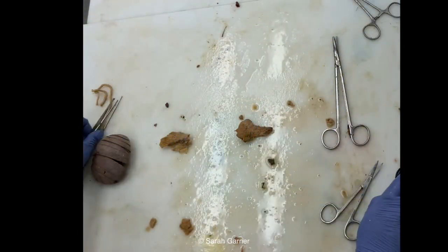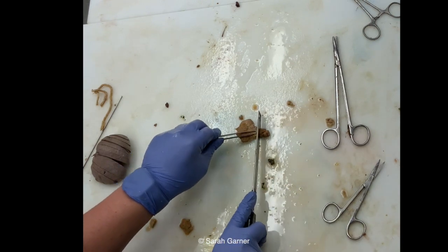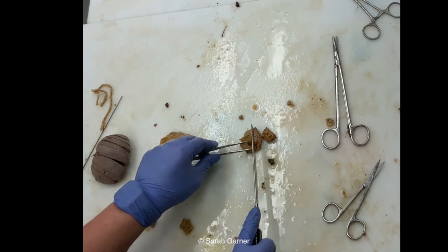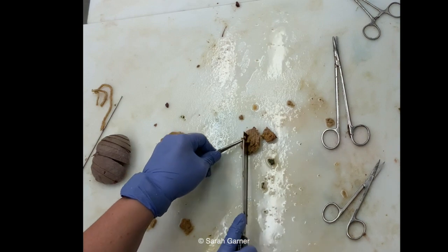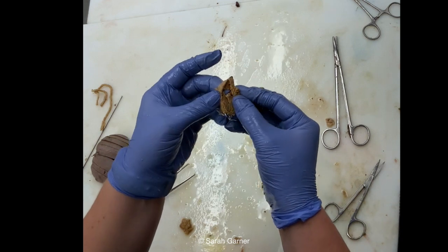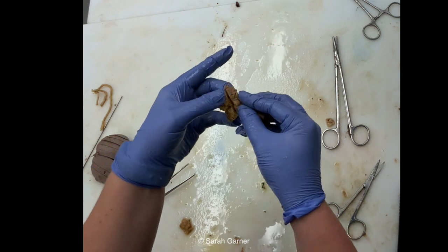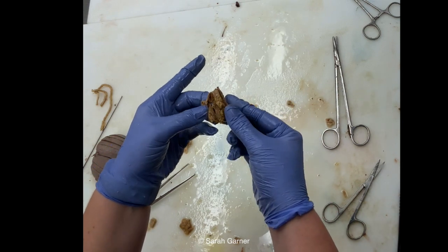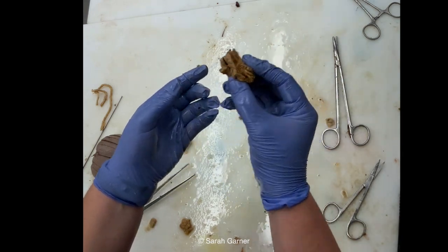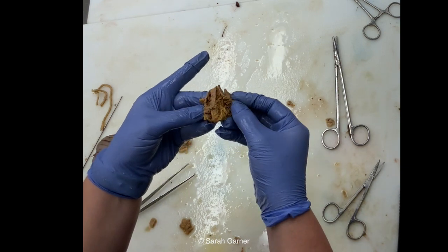Now I didn't cut these open for you, but after you weigh these, you're also going to want to cut them open just like you do with all of the other organs. Are you seeing a theme? When you cut the adrenals, oftentimes they're going to be pretty mushy, so I wouldn't recommend using a long blade. Definitely use a scalpel for that. This is what the inside of an adrenal should look like. The outer cortex part should be bright yellow and pretty solid, and then the inner part is the medulla, typically a little bit more brownish. Especially in fixed bodies, it's going to be very mushy, so you definitely want to weigh this before you section it. But that's what a normal adrenal looks like.